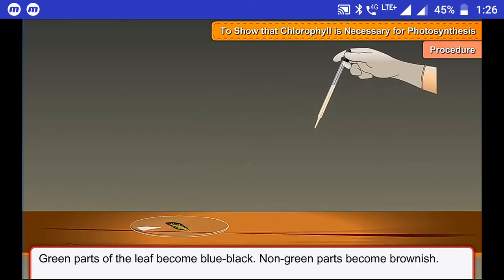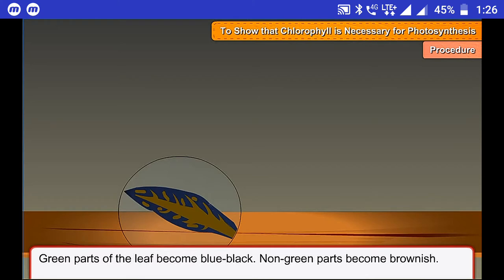Green parts of the leaf become blue-black. Non-green parts become brownish.